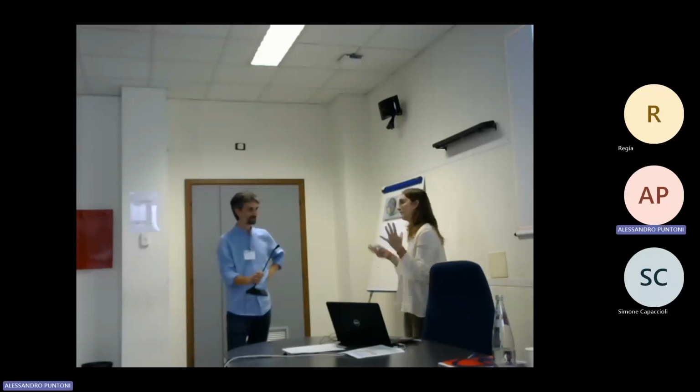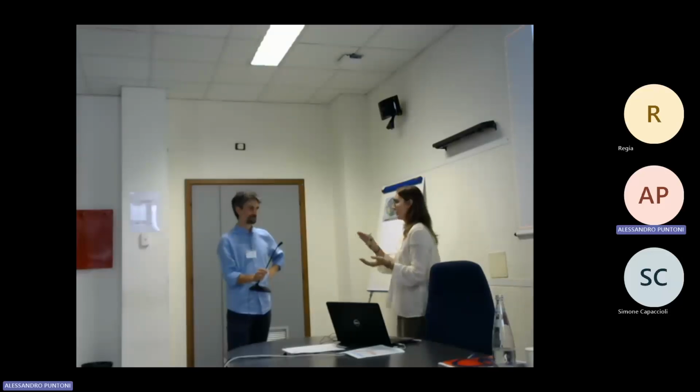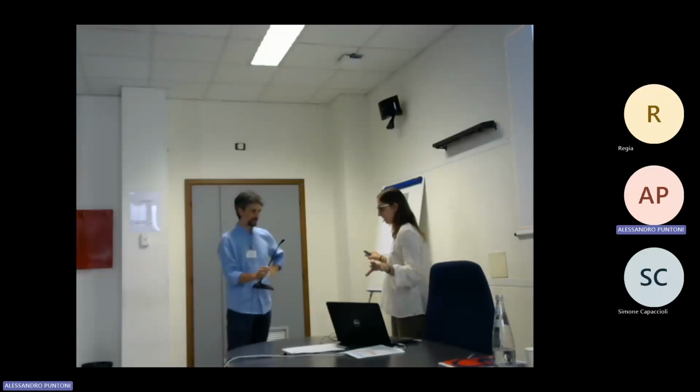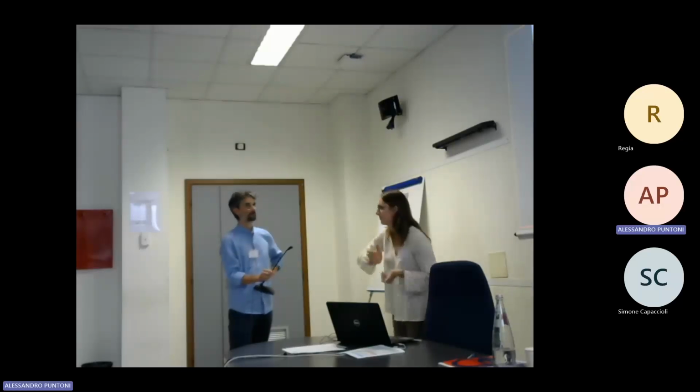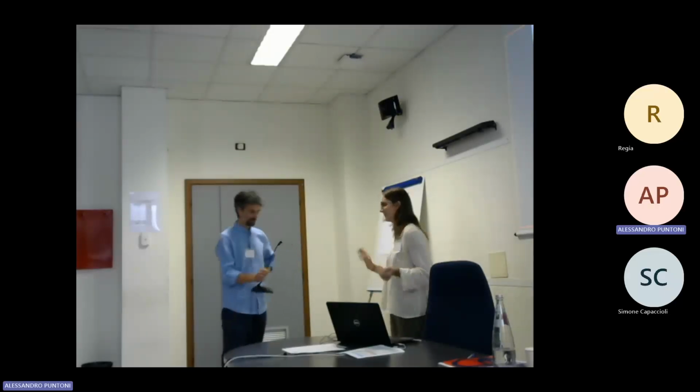Before doing an image, I fix the cell, so that is not live imaging. And I spend, it depends, more or less 20 minutes to produce an image in super resolution with this technique. But the cells have to interact with the materials, it depends, for 7, 10, but also 20 days before differentiating. Okay. Thank you.